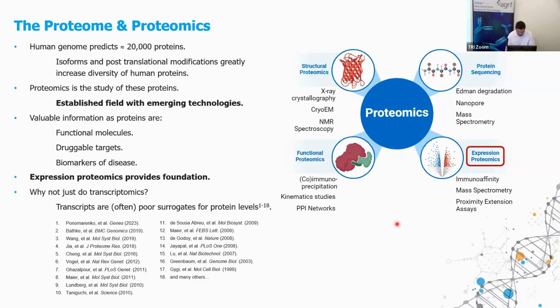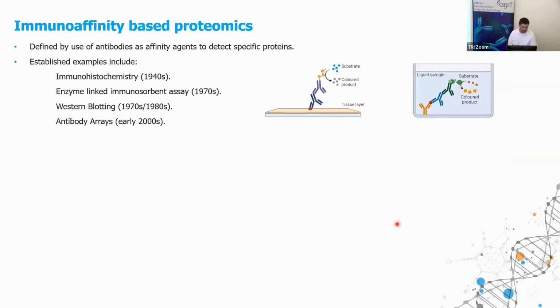To delve deeper into the existing technologies which are used in expression proteomics projects, immunoaffinity proteomics is probably something you get exposed to almost straight away as an undergraduate if you're doing a molecular biology or biochemistry degree.